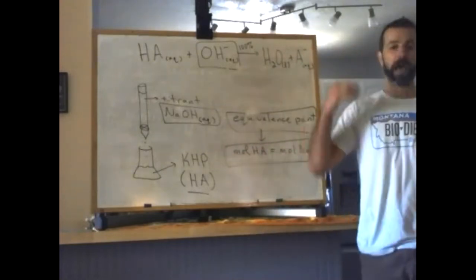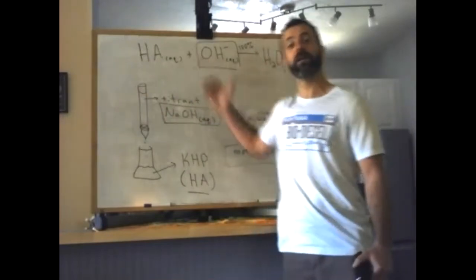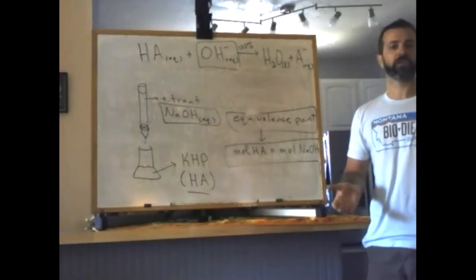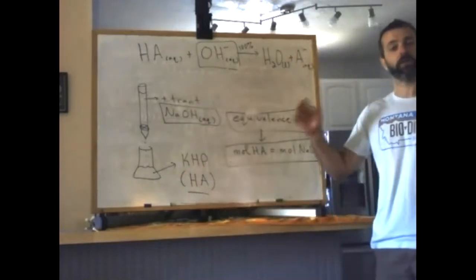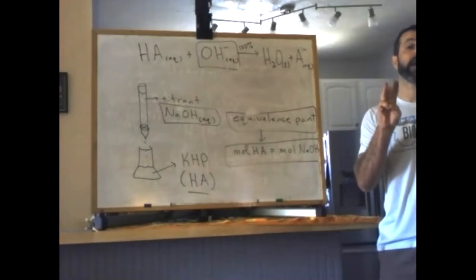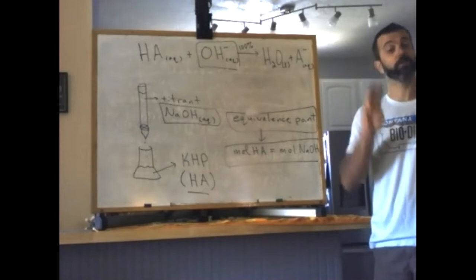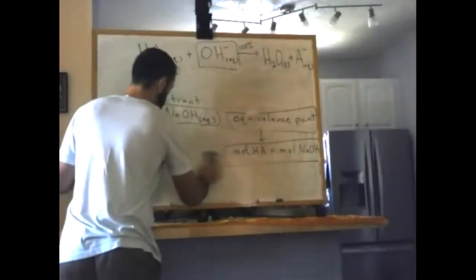Once we know about how much it takes, then for our other titrations, we can go fast in the beginning until we approach the end point. And then as we're approaching, we can really go slowly and dial it back. So it actually saves quite a bit of time to do a really fast titration first, and then do 3 careful ones. So we'll have 3 data points we're going to perform calculations for. Okay, so we will be able to find an average concentration of NaOH from these 3 sets of data. All right, so let's say we had the following.